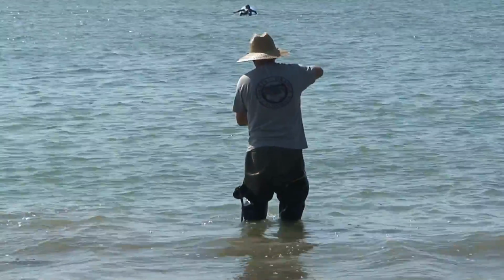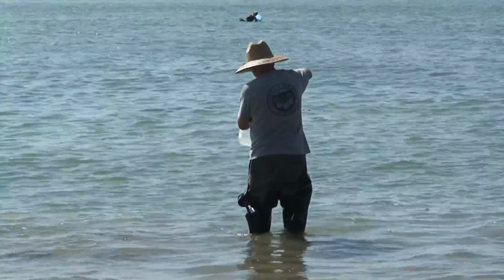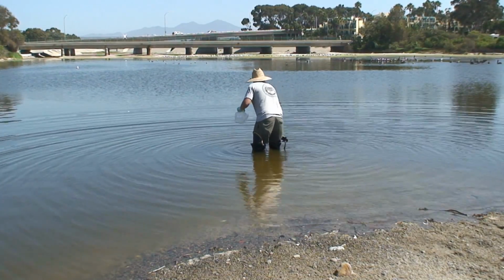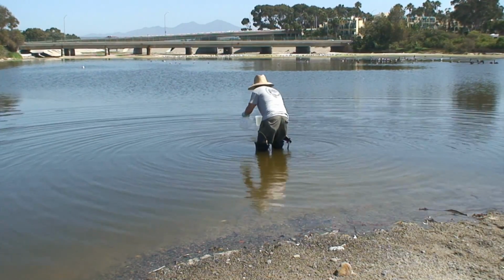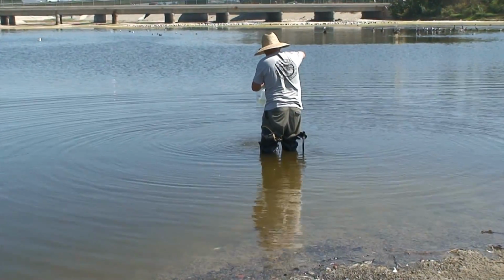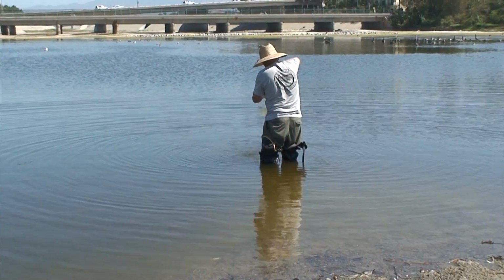The second thing we're doing is looking for bacteria. We're sampling both on the beach and up in the watershed, and we're testing the storm drains both with culture methods where we measure live bacteria, and we're also filtering and freezing bacteria on filters for later analysis. So during the 30-hour study, we performed water quality analysis on all of the sample sites by using two of these more traditional culture methods.